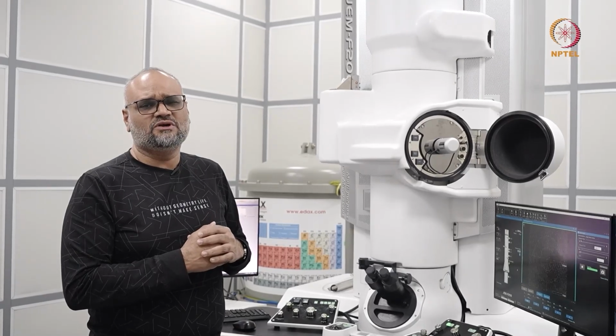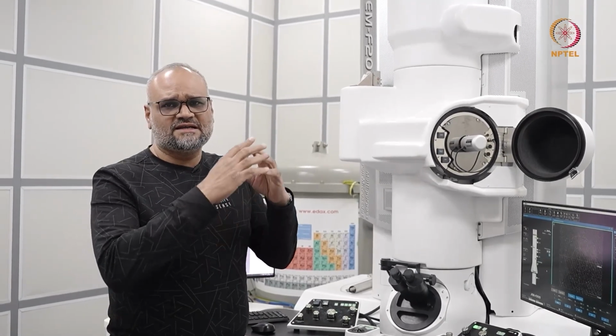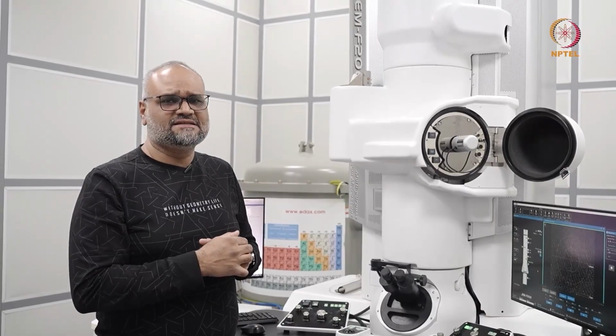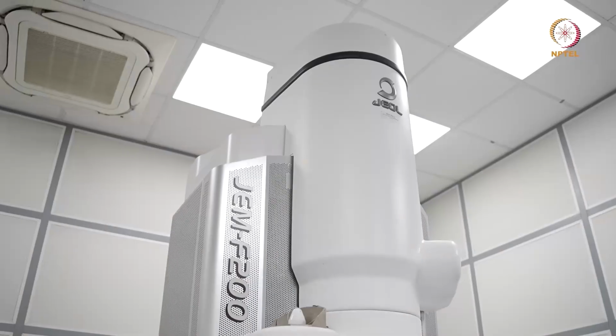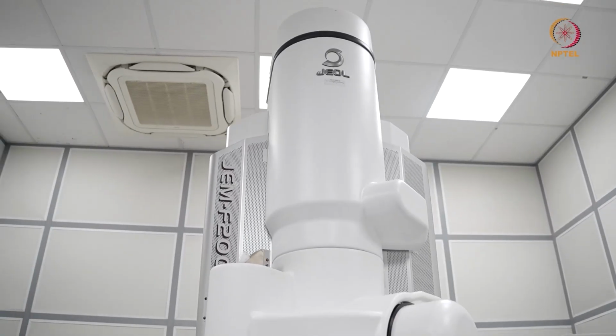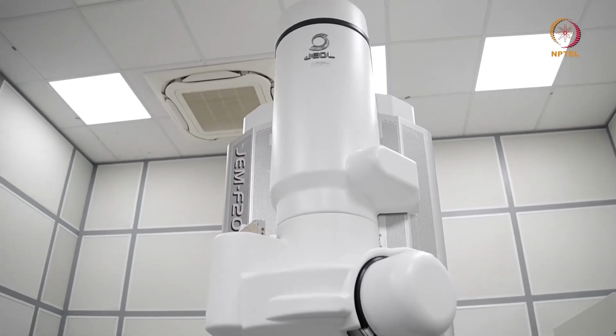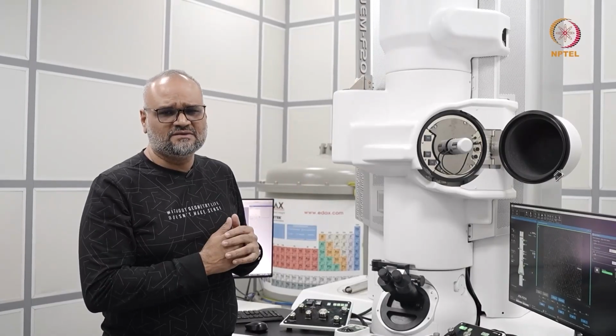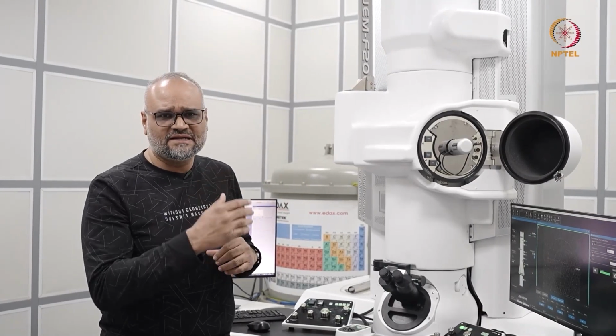So when you flash, what you do is you remove any oxide or a redeposited layer on the tip of the filament, and this is an automated process now. Earlier this was all manual control and through turning of many knobs, and it was more difficult to maintain a cold field emitter. But thanks to the automation now, you can actually do a flashing every day.